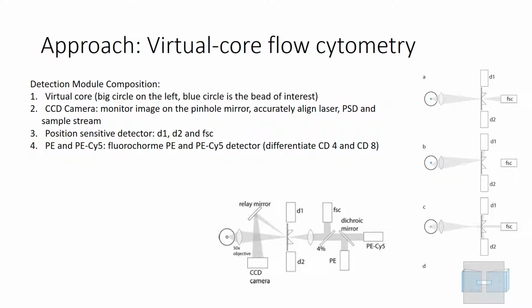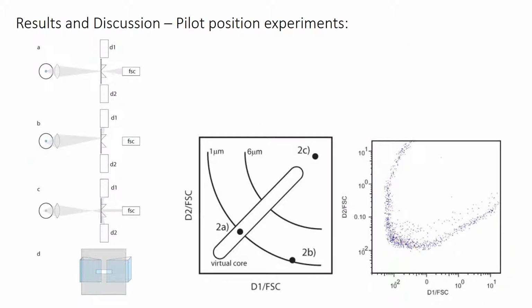Also, part of the laser beam is also analyzed by two transducers. Two fluorochrome transducer detectors are attached to this system to analyze its fluorescence information. To better compare the results of this flow cytometry with traditional cytometry, three experiments were done.